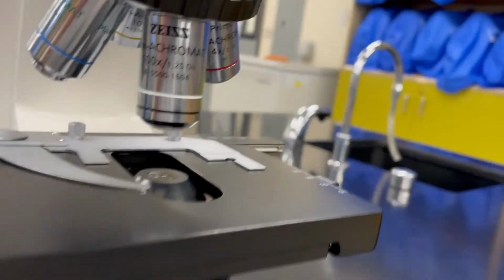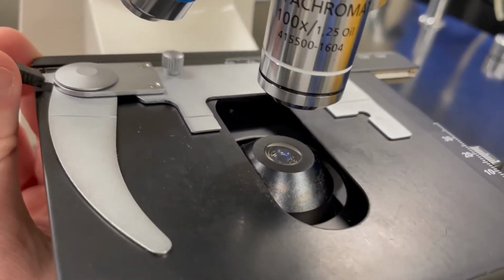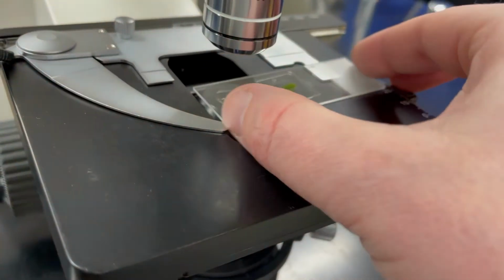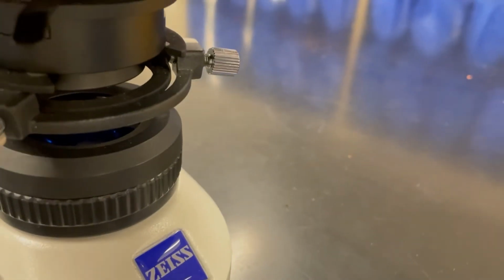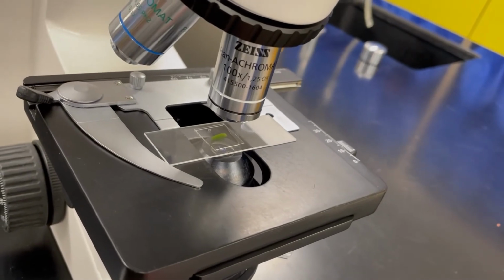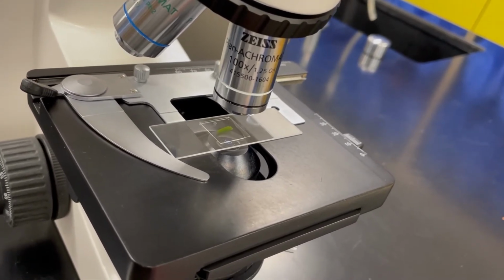So just below the objective lenses is the stage. And you can see there's a little bit of a lever here, and what I can do is I can put a microscope slide in that stage. So let me do that for you right now. And I'm going to just put that microscope slide in. Unfortunately, this needs 2 hands. So there I just put a microscope slide in, and what you can see is I have prepared a wet mount. And we'll talk about how I prepared that in a minute or 2.